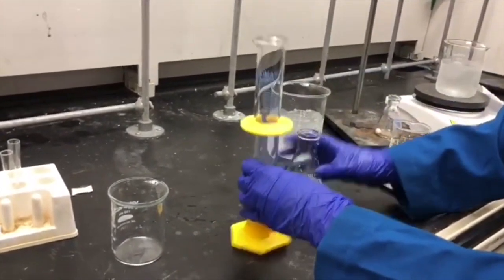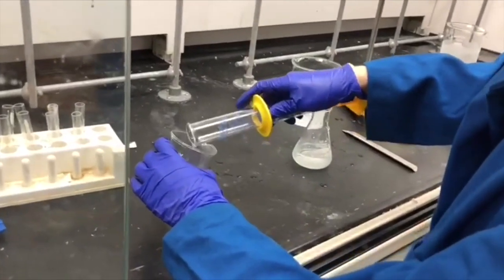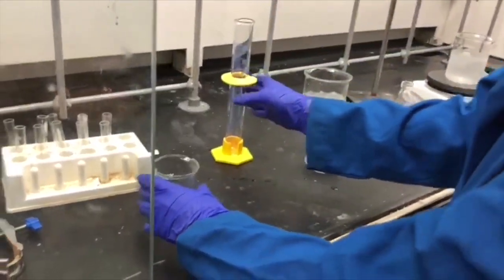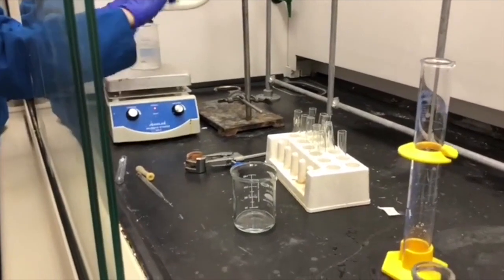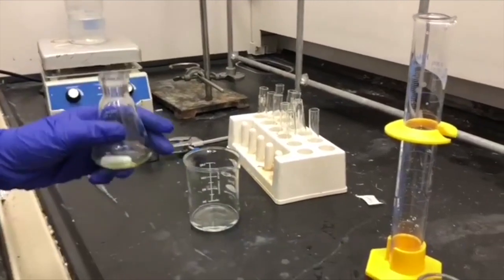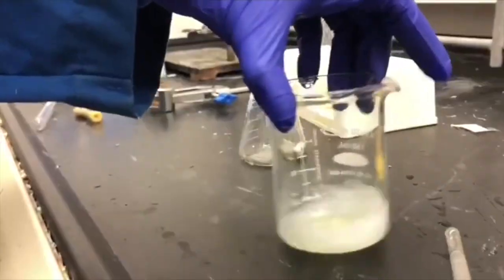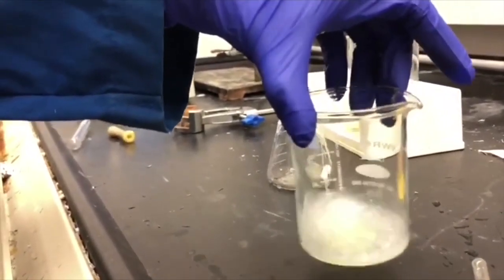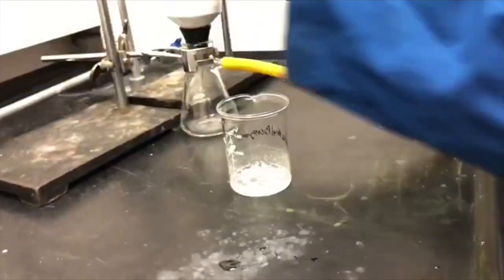Here I'm measuring out 10 mL of chilled water, and our reaction mixture will be added to that water. Again, you see the precipitation, that is our product, and we're going to use a suction filtration.